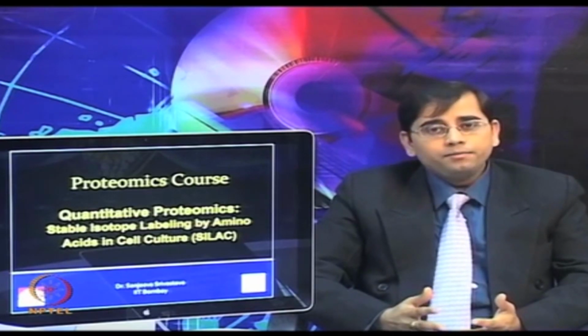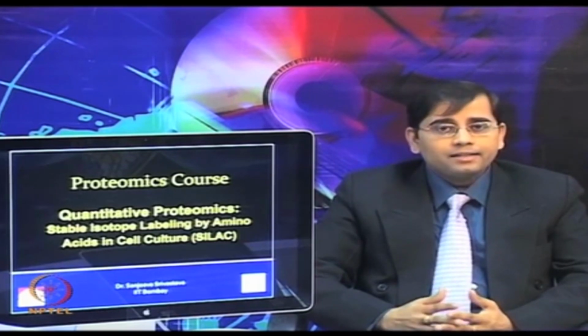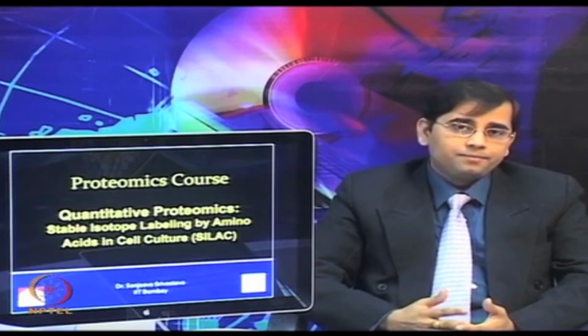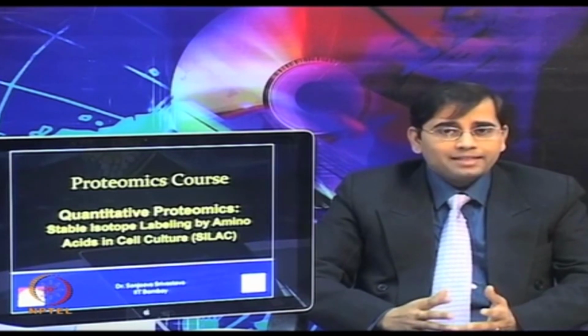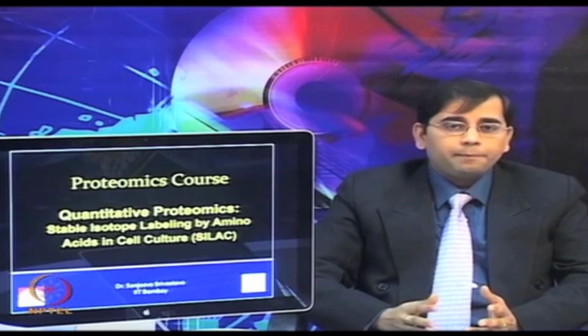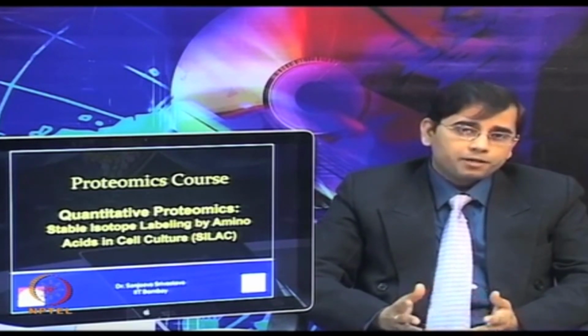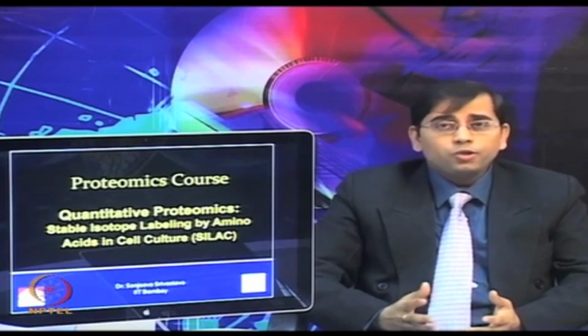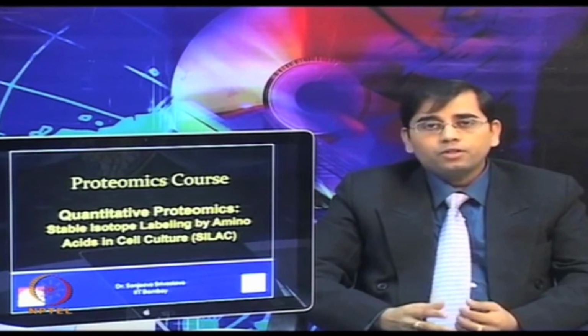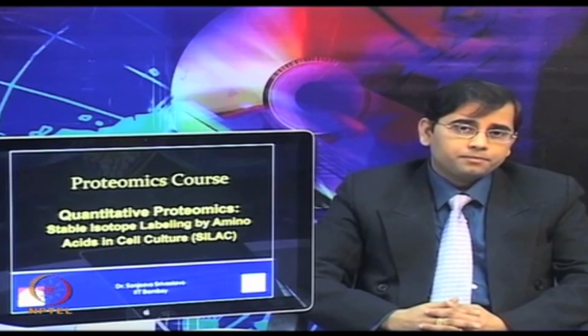MS has proven to be an extremely powerful tool to characterize protein complexes. However, MS is not a quantitative technique to begin with, and peptide ionization efficiency is unpredictable. So, the usefulness of this data for quantitative purposes remains limited.